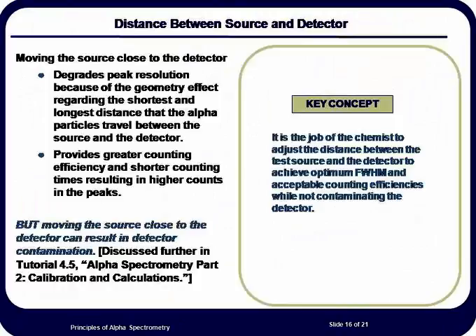Thus, it is the chemist's job to find the optimal distance to count the sample from the detector, taking into account resolution, efficiency, and contamination.